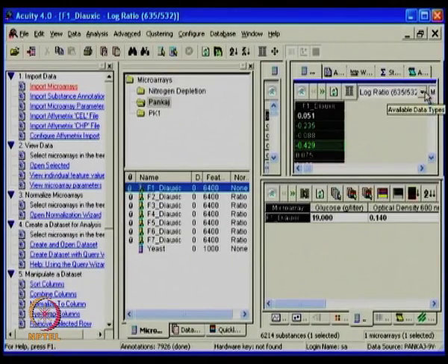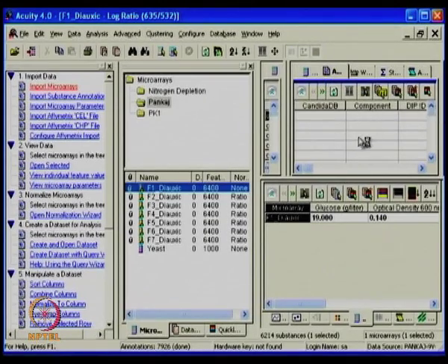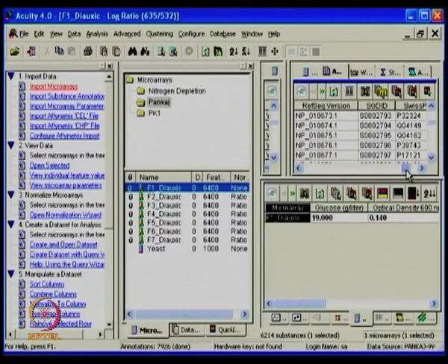In a similar fashion, I can look at any other one, because it is a GPR import, whatever GenePix data you have to watch for. You can look at the background, signal, individual intensities, but the majorly used one is the log ratios, especially for expression analysis. But if you use protein or single wavelength based data, you can look at only one wavelength. So you can always control what you are watching. Apart from this, the other tab includes the annotation, which shows what different things one is tracing at the level of annotation names in the form of different databases, information on the genes or how the protein is behaving, or even the localization, so where it is being localized, all that can be traced.